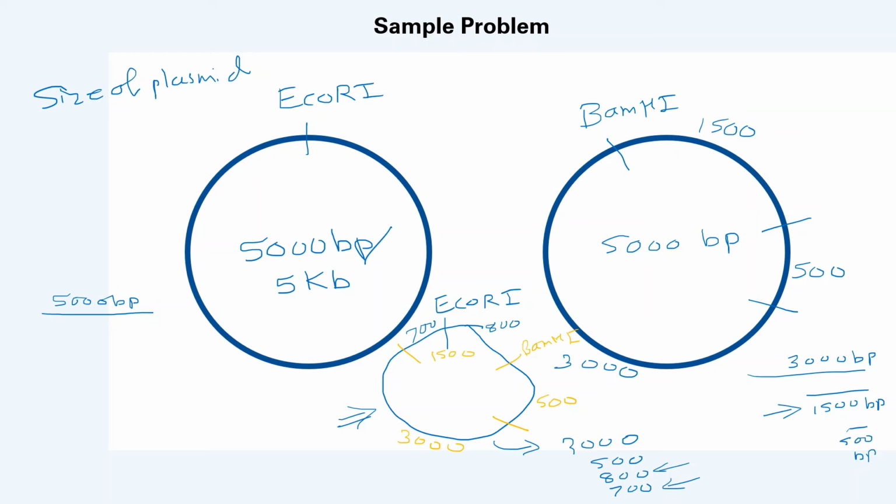Now, on the next slide, we will take an actual example of the restriction digest and plasmid mapping. So let's move to the next one.